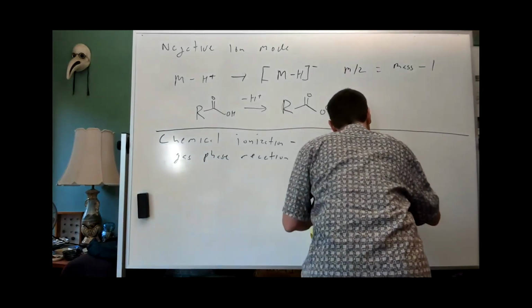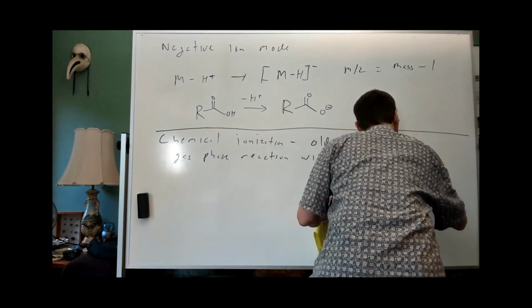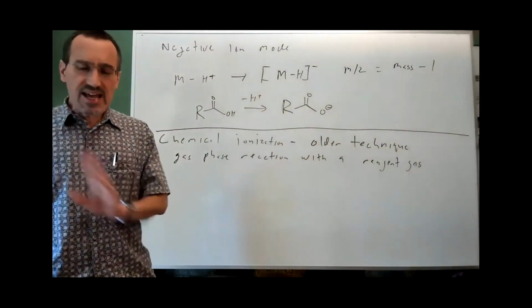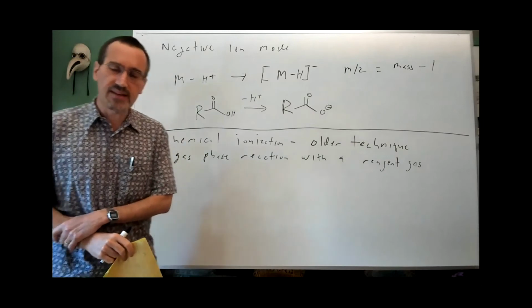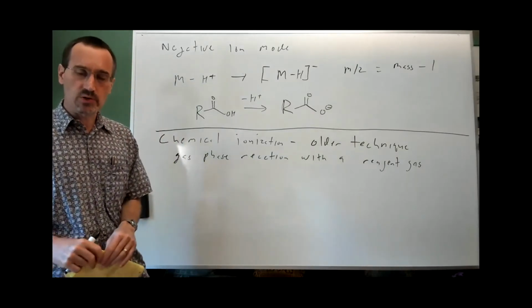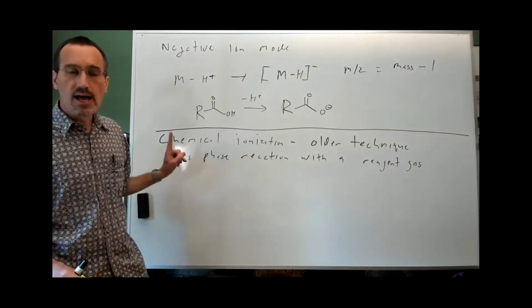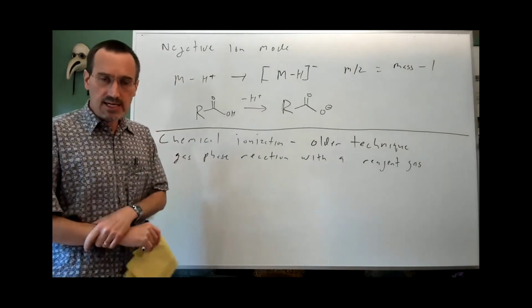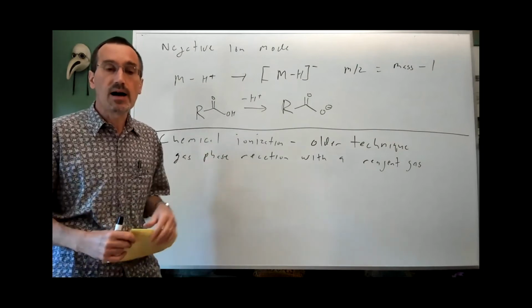With a reagent gas. And your Silverstein homework doesn't have, I think, any electrospray ionization or any MALDI-TOF in it. It only has electron ionization, which we're going to see in a moment, and chemical ionization. And I want you to read, as you read Silverstein, and that's today's reading assignment, or maybe it was Friday's, but we're a little bit behind.